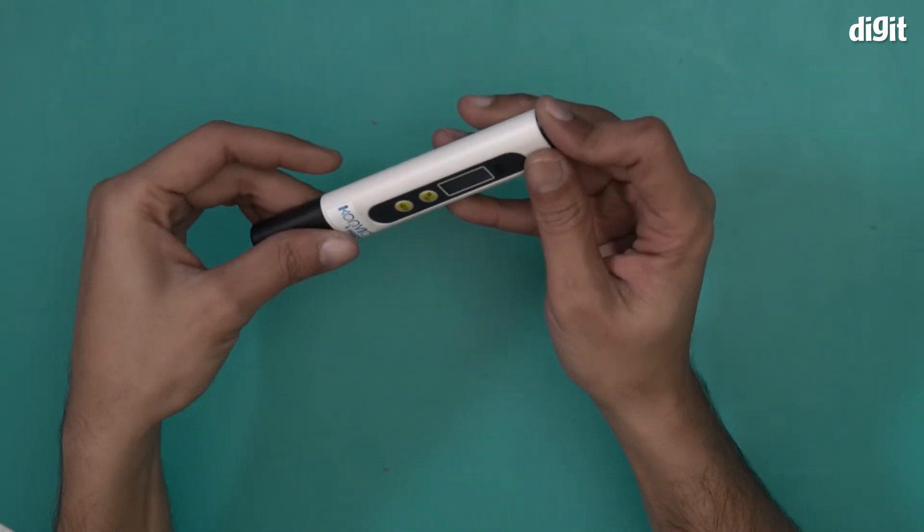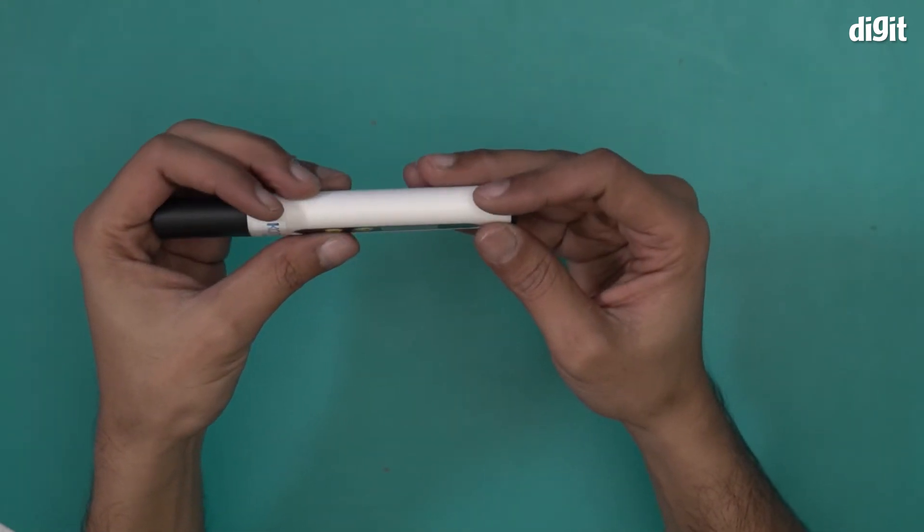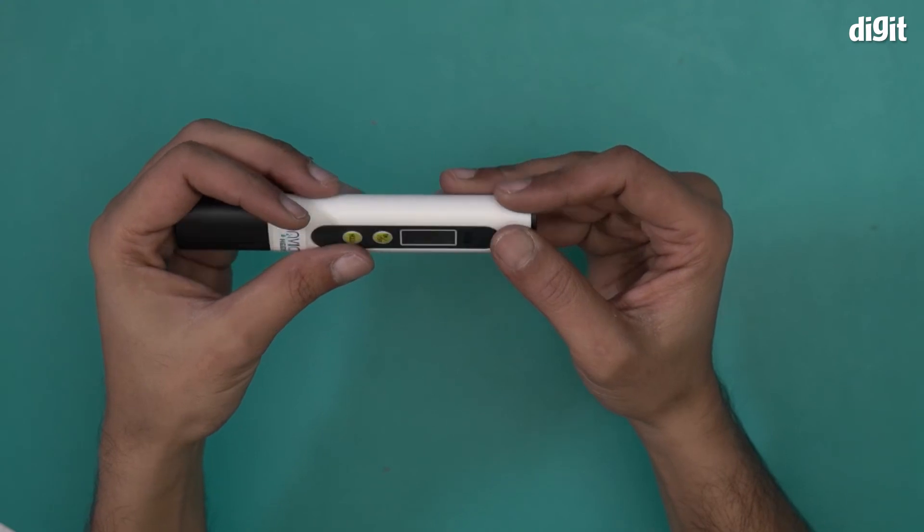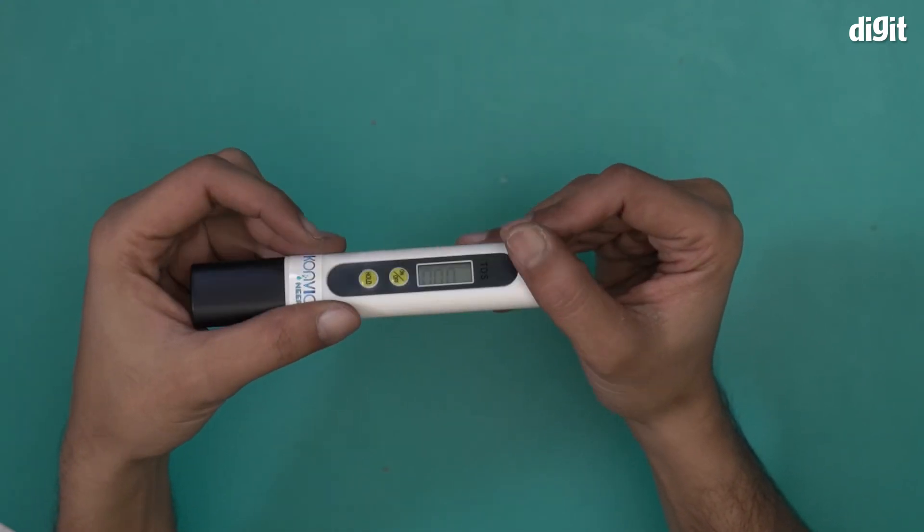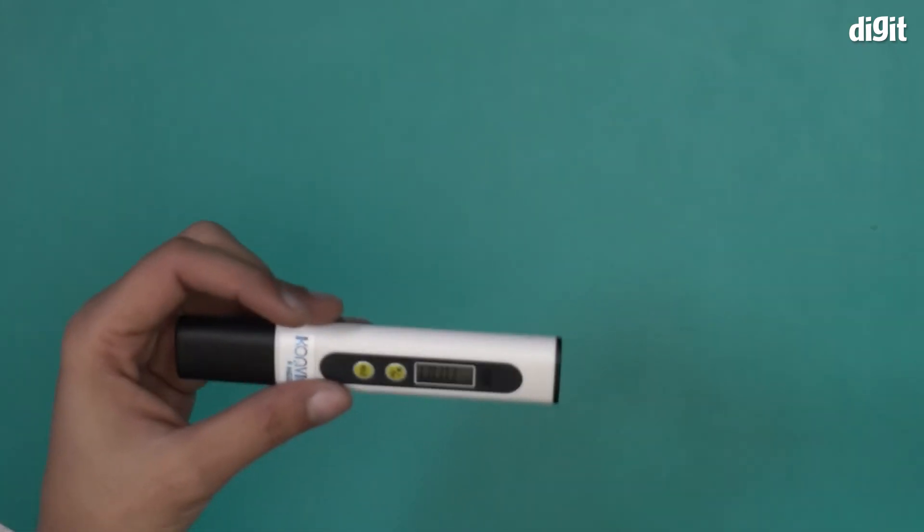What happens if I press on? Okay. You do have some display. It says 21.1. I think that's... oh, it's actually zero. So I'm assuming that's a default figure, of course zero ppm. It's not measuring anything. It should be zero.